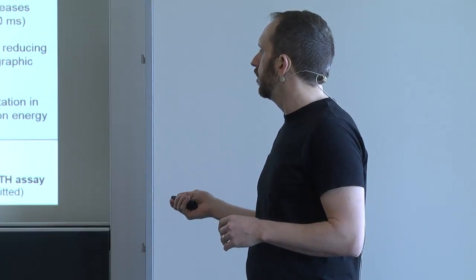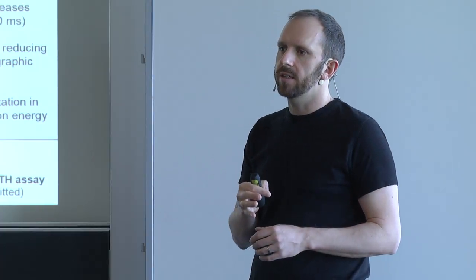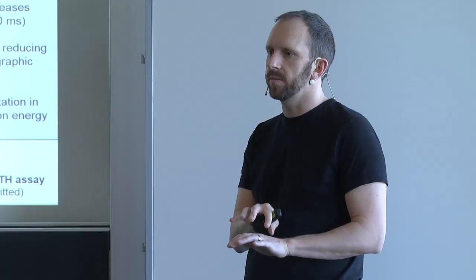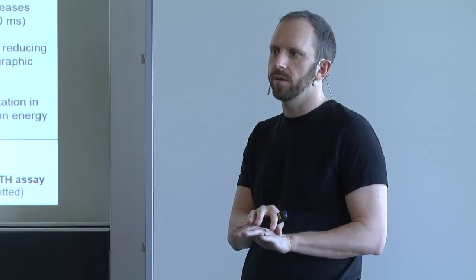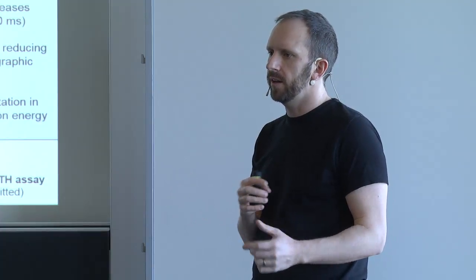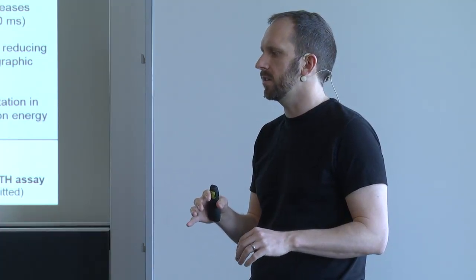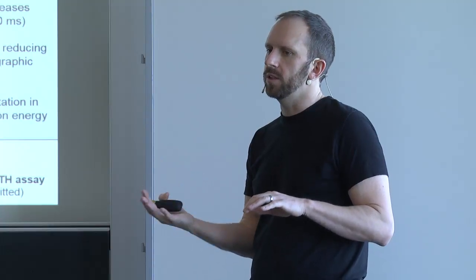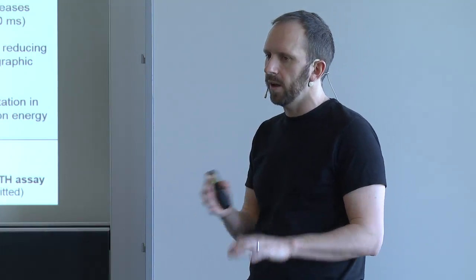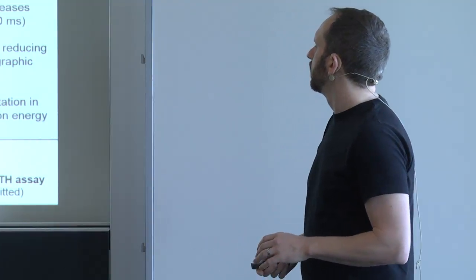But what we can do is change the DDA settings to match this collision energy setting, right? Then you get the highest similarity between the DDA and the SWATH spectra. So this is again something that might compromise a little bit the number of identifications that you get in the DDA analysis, but the resulting match between the DDA library and the SWATH data will be higher fidelity in a sense.